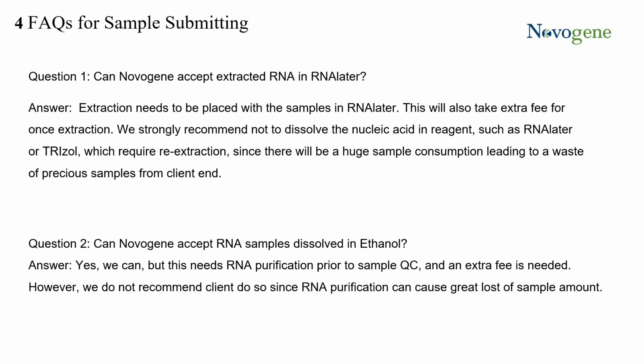If you put your extracted RNA in RNAlater, we need to re-extract the RNA, and we cannot guarantee results, because this could cause huge sample consumption, leading to the waste of precious samples from your end. So we strongly recommend not dissolving your total RNA in any reagents like RNAlater or TRIzol. Please elute your samples in the elution buffer or water or double distilled water.